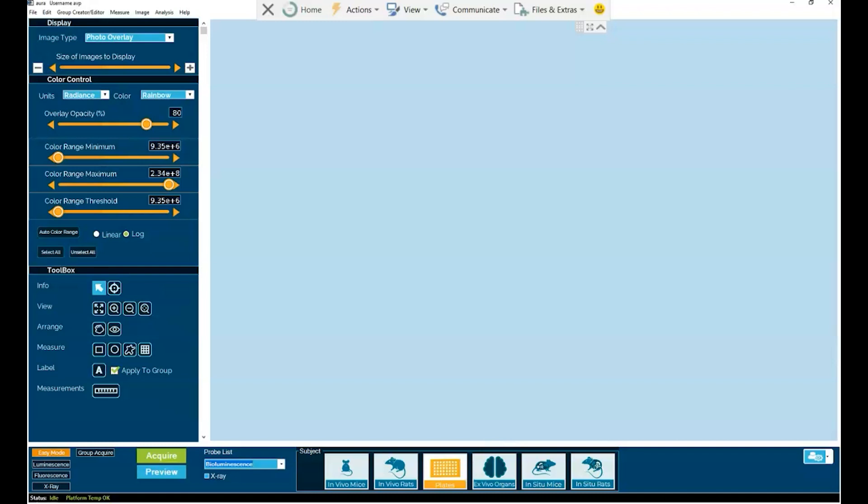And this aspect of smart auto exposure can come into play in a wide variety of models, particularly in oncology, where one may be looking or expecting to see metastatic lesions from a primary tumor. And the faint signal of these metastatic lesions can be nicely acquired while also recording the primary tumor.